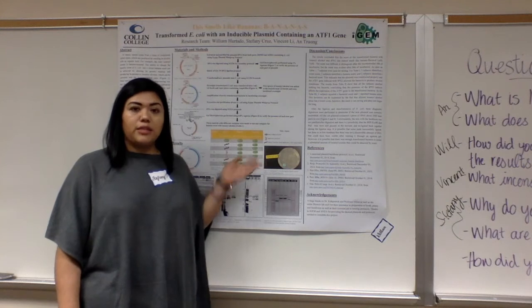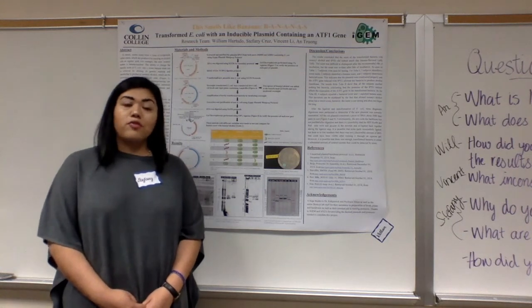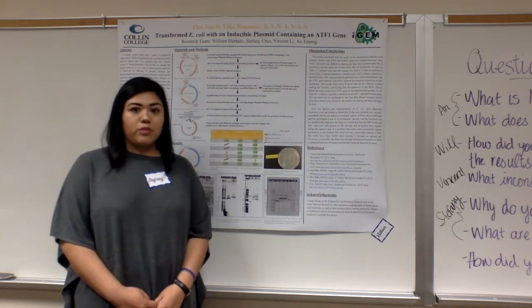We also noted that after 2 days of incubation, the banana scent was very minimal. And after 4 days of incubation, the banana smell was potent.